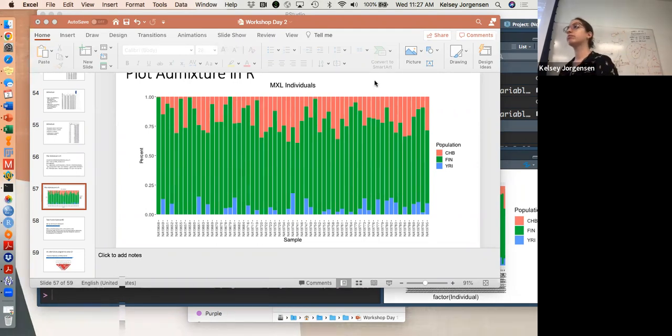But if you wanted to have an other for the subcluster, could that subcluster include a variety of different regions instead of just one place? Yeah, it could. It just depends on the populations you put into it, right? So if you wanted to look at these individuals on a greater level, I would probably import more individuals from 1,000 Genomes, and then instead of just Han Chinese, it would most likely cluster Han Chinese with other East Asian populations, right?